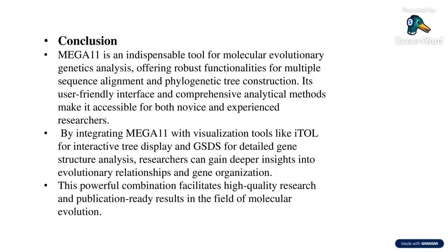But there is also a limitation: it requires internet access or a web page. If we upload a large file or use features that are not in the free version, that is its main limitation, or that makes annotation time consuming.